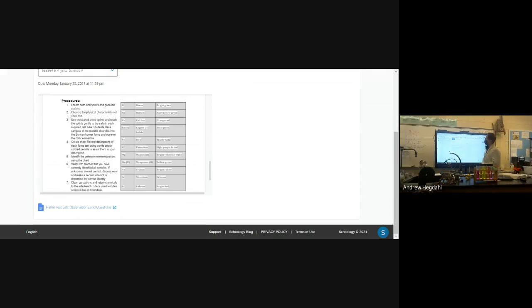All righty, so the part that you actually fill out, though, is going to be this table. The instructions are embedded separately from the assignment part that you do. At 5 lab stations are sample sets of the different salts that you're going to test.